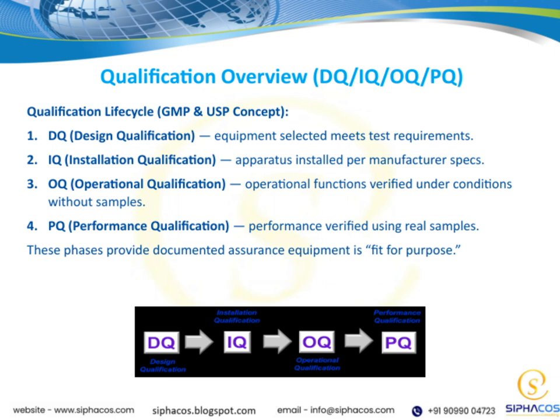Then comes operational qualification, or OQ. At this stage, we verify that the equipment operates correctly under specified conditions, even without using actual samples. This ensures that the operational functions perform as intended.